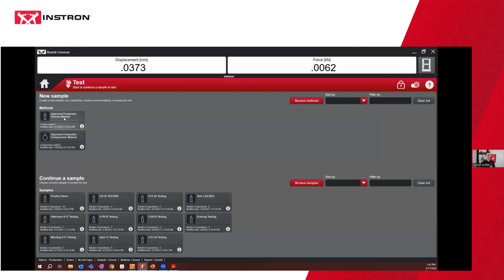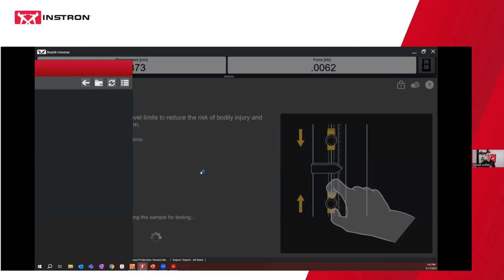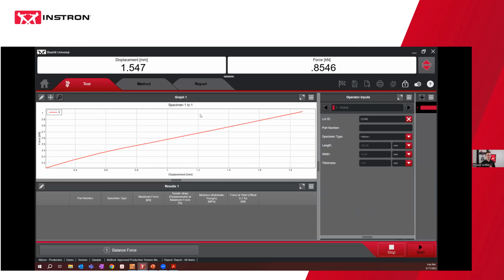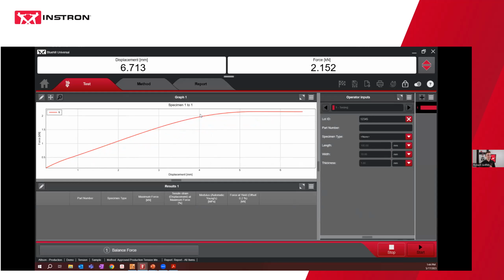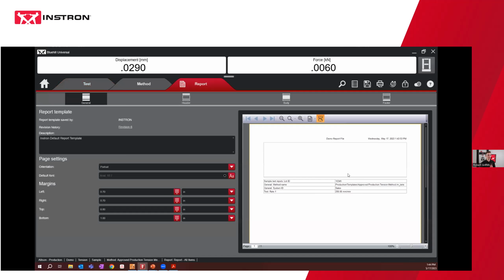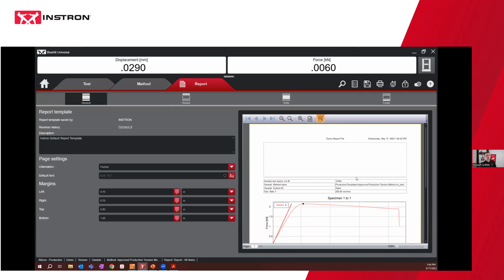if I want to open up, I believe I can do it in this one. Just going to run a dummy test. All right, so this preview should now populate some results. There you go.